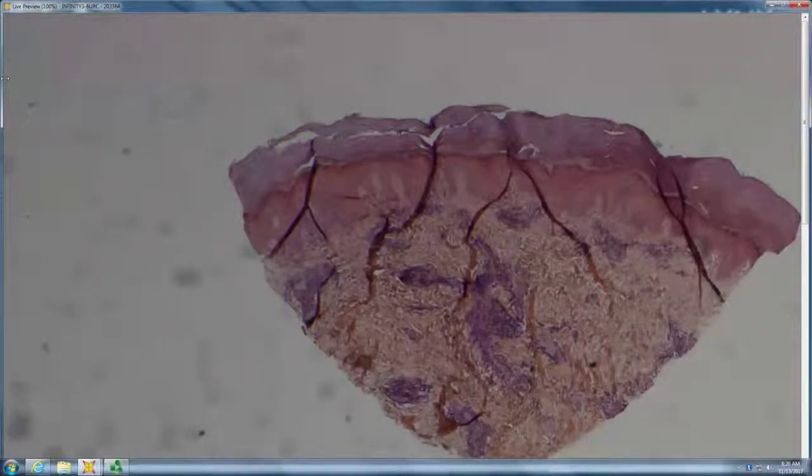PPD, and what do you have to look for in PPD? You want to make sure it's not MF. Yeah, and so here you've got that one angulated big lymph sitting there. Just one. But that's probably enough to make you do additional biopsies and take a look at the patient, because you shouldn't usually have a big, hulking, angulated lymph tagging at the basal layer in PPD. So that's a clue that maybe you would need to look a little closer at this patient.